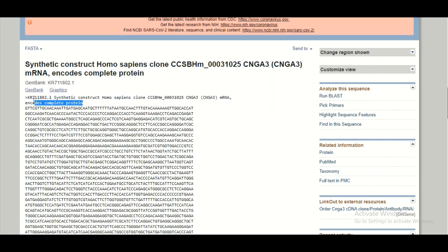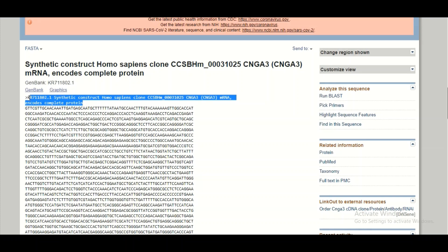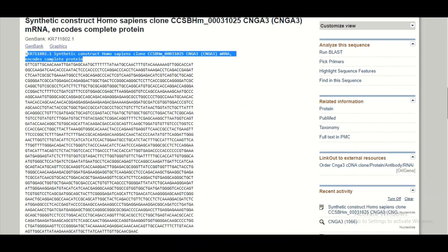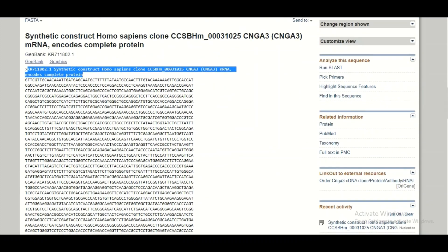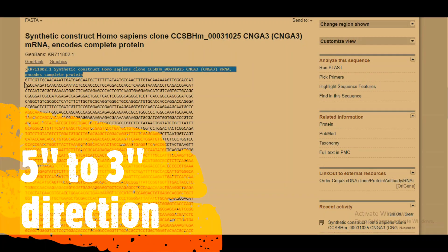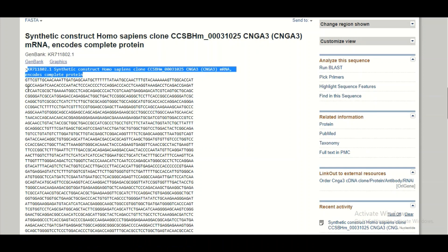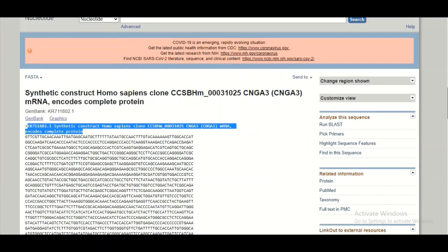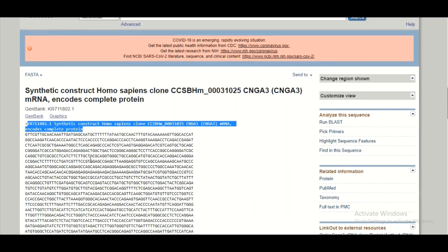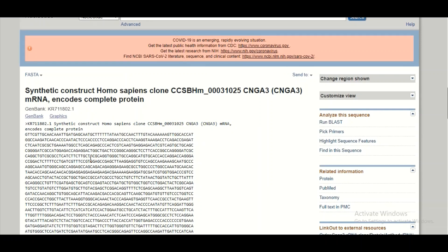Keep in mind that the accession number and definition can be safely ignored in FASTA format, but the greater-than sign must always be present before the sequence starts. Also remember that in both FASTA and GenBank formats, sequences are always written in the 5' to 3' direction.